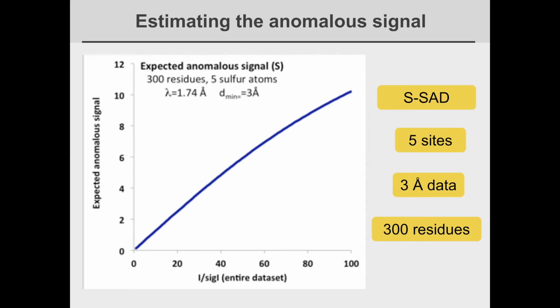Okay, and there's another question about how strong an isomorphous signal we need to get for SIR or MIR to work successfully. And compared to SAD, does it require higher data accuracy? Actually, typically it works the other way around. For isomorphous differences, typically the differences are very big in situations where you can realistically solve the structure. And in fact, errors in measurement can be very large in isomorphous replacement.